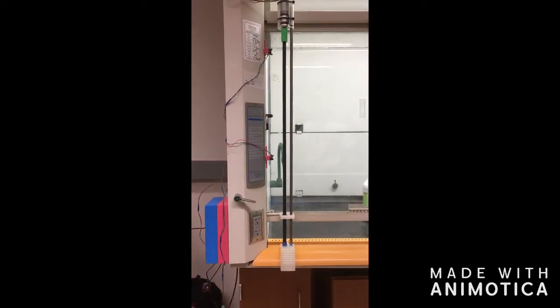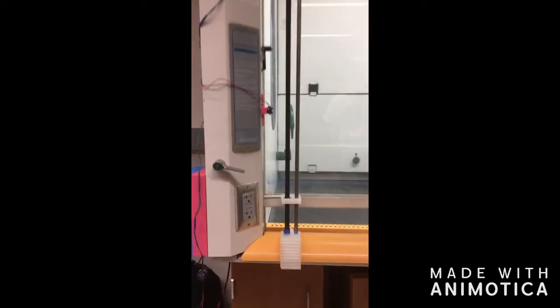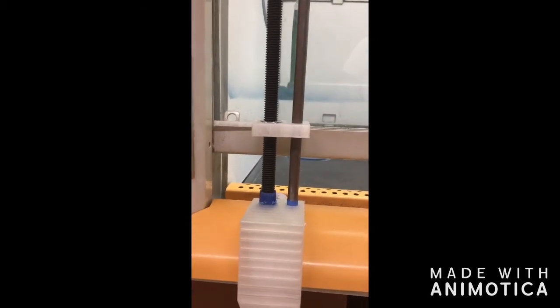Our device was able to get within the 4-inch limit, but was only able to get down to 2.5 inches from the face of the hood. Though the compactness criteria were not completely met, we believe the spirit was fulfilled.